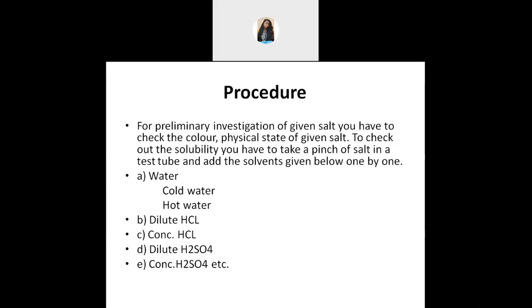After the salt dissolves, you can clearly see the color of the salt solution. So whatever color you are observing, you have to write down that color as the color of the salt solution. Got it? Or should I repeat it again?